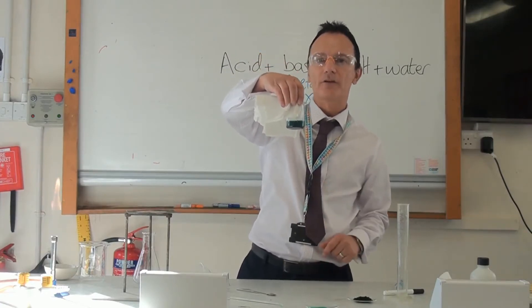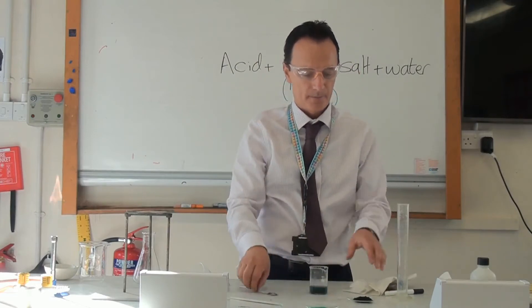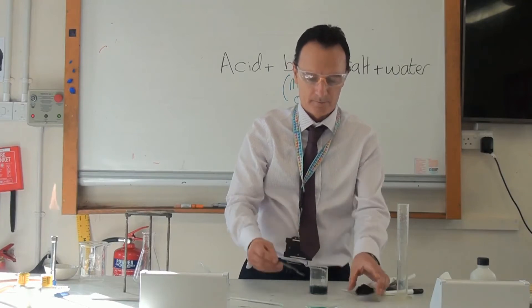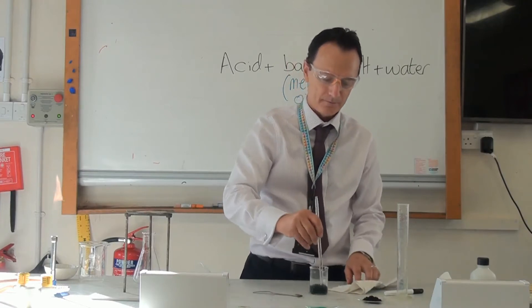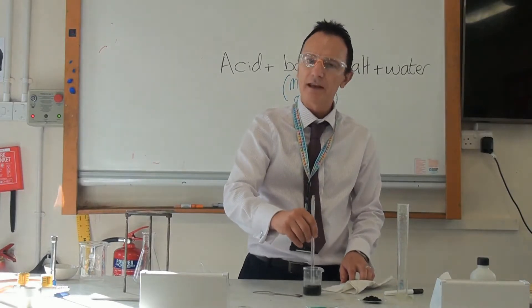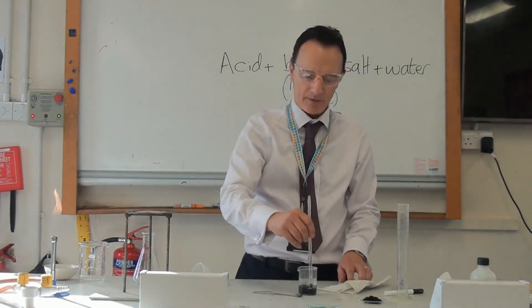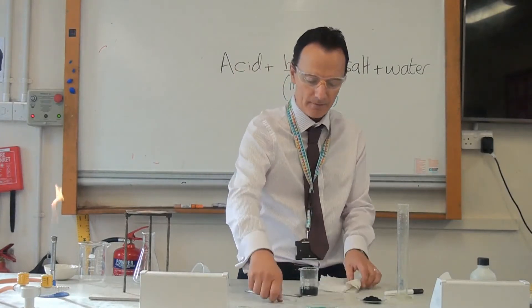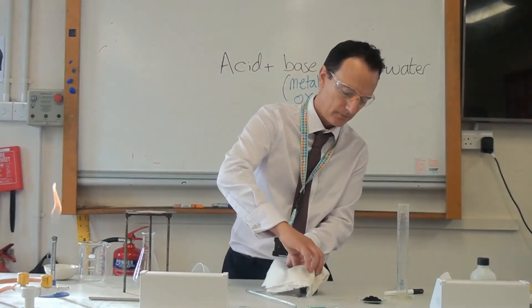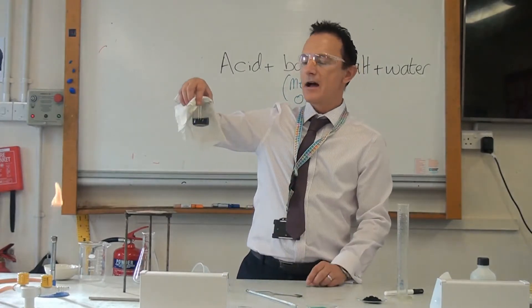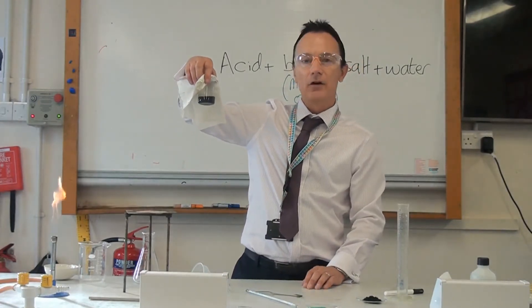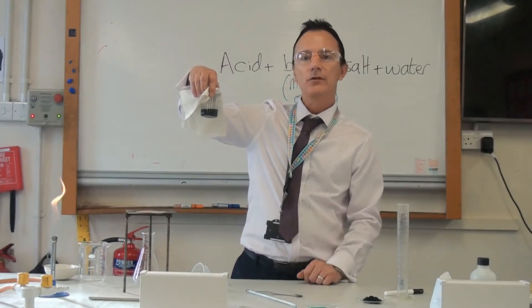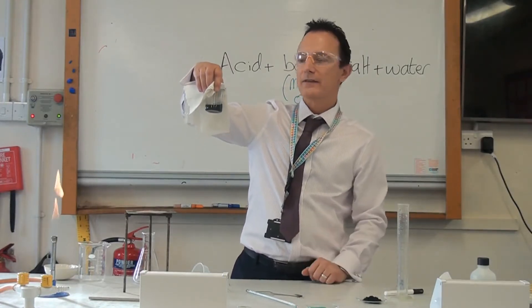We are going to add one more spatula of copper oxide and give it a stir. Because it has been warmed, it shouldn't take long for all the acid to react with the copper oxide to make our salt and water. In there now we will have our copper chloride salt, but we have also got too much copper oxide because we added too much deliberately to ensure all the acid has reacted.